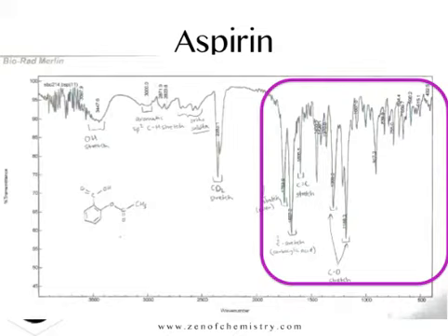For the purposes of basic level qualitative chemistry, there's a few that I'd like to point out in particular. So the OH stretch here, that's our OH there, so it's only a little peak. The OH stretch is usually quite a broad peak. It can be actually quite large, so you can sometimes see that it's quite a large broad peak. And when I say broad, I mean wide at the base, as compared to some of these peaks, you can see their bases are quite narrow.